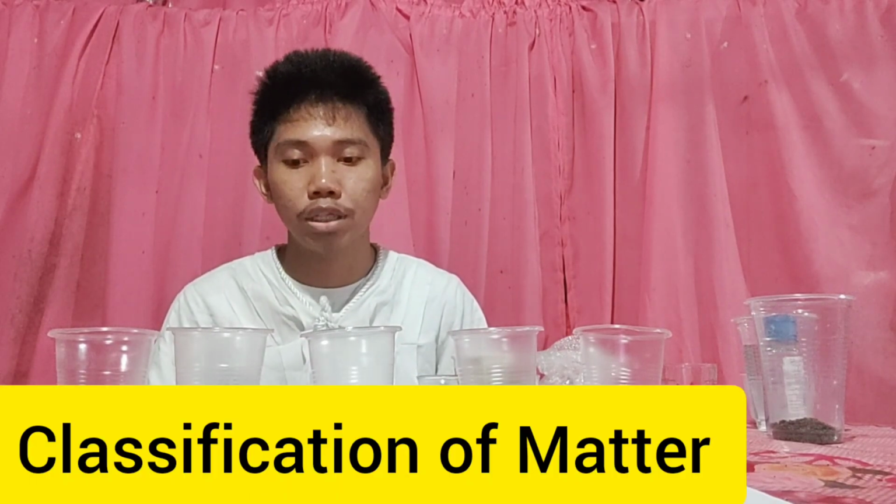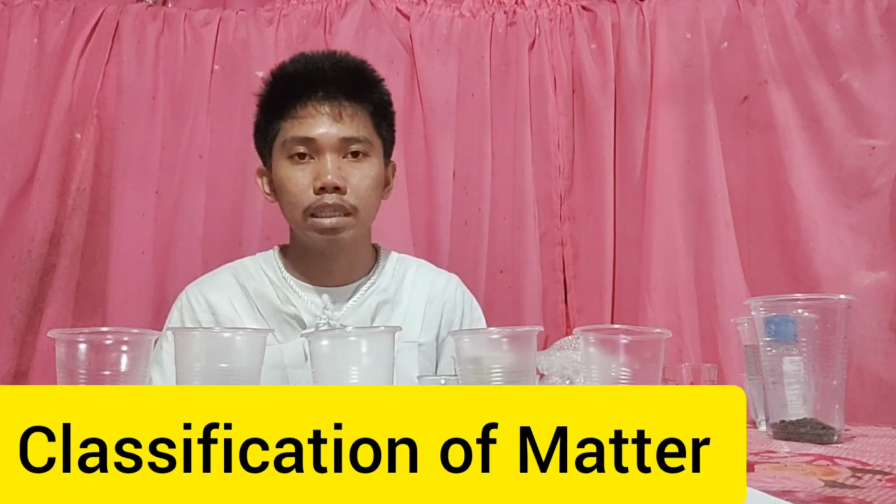Good day everyone, my name is Ryan Jordan Yames from Science SC13. We are going to do an experiment about the classification of matter in our laboratory activity number 3.